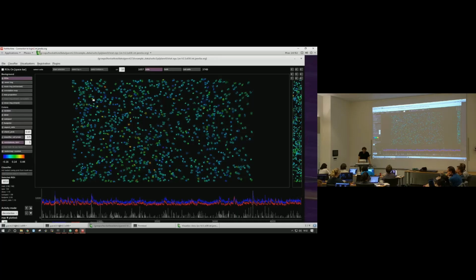And of course, if you have a behavior, that's even more important because behaviors are very fast in mice and all animals, I guess. And so there you have more and more of a temporal problem, right? You want to localize things in time as much as you can and undo a little bit this problem of long GCamp timescales.